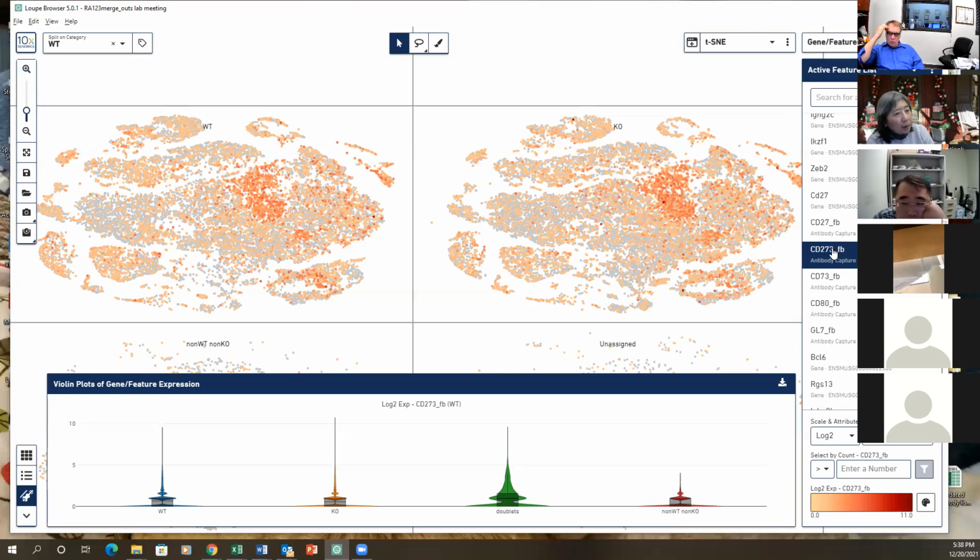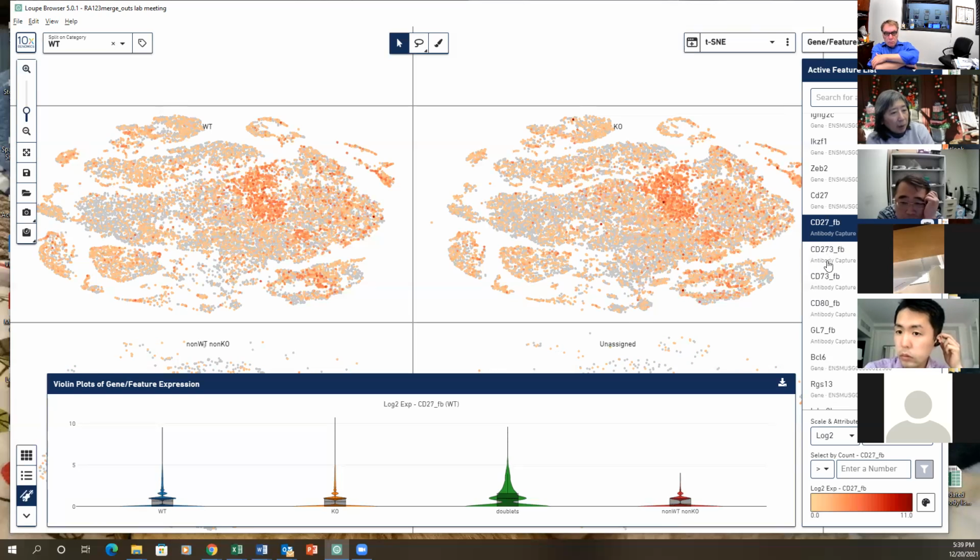So it's the gene expression, but for each group, all the cells were stained in the same tube, so they are still comparable. We can compare the transcriptome, but we cannot say relative cell population wise.